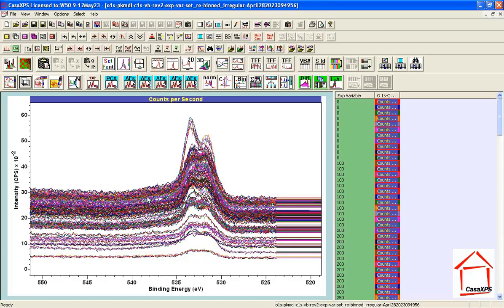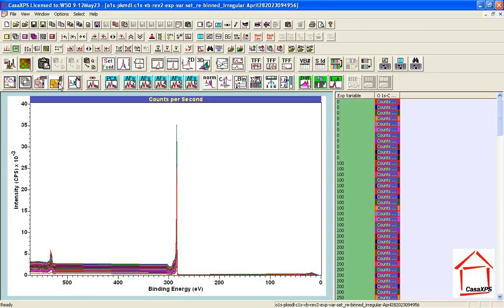To do that, I'd like to reduce the noise in the data. I can create spectra that are a good approximation without as much noise by calculating principal components — choosing a limited number of principal components to fit and reproduce the data with precision expected for pulse counted data, ending up with noise-reduced data. Let me perform that operation, applied to the oxygen, carbon, and the valence band all at the same time, by pressing the PCA button.